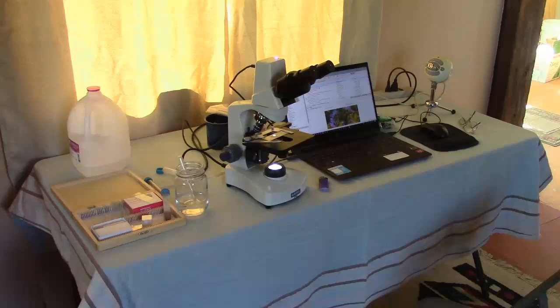In this video, we will be talking about assessing your live soil under the microscope.